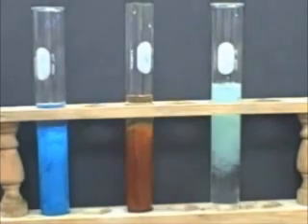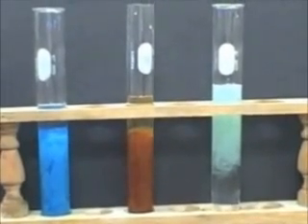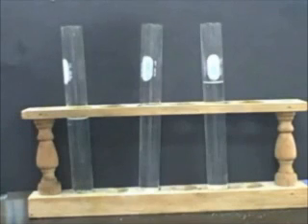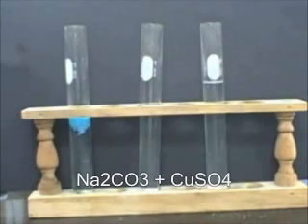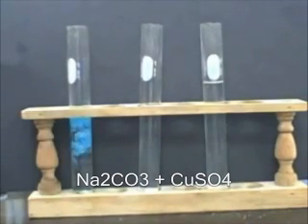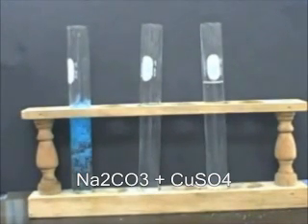In our next vials we have 3 solutions of sodium carbonate. Again, sodium carbonate is soluble because even though carbonate is generally insoluble with metals, sodium is a group 1A metal. So when we add copper sulfate to the sodium carbonate, we see that copper carbonate forms, a precipitate, because according to the solubility rules, the carbonates are generally insoluble.